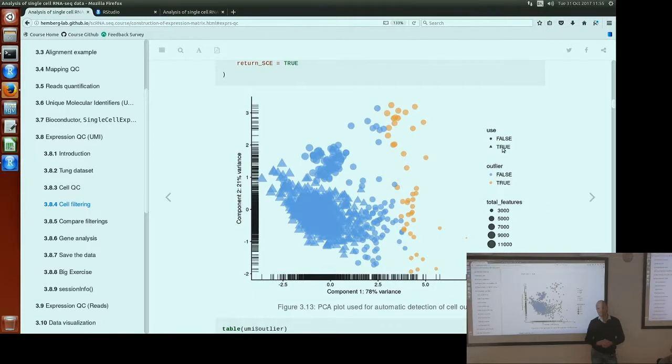Yeah. Does it really matter? I mean, how does it matter? Because that suggests that even though the amount of RNA is low, the number of transcripts was high enough to be similar to the cells. You see what I mean?